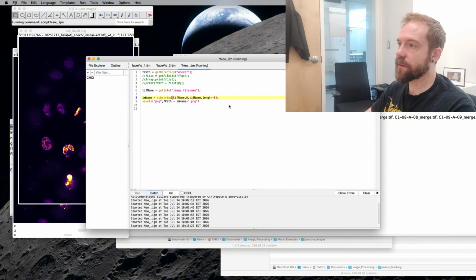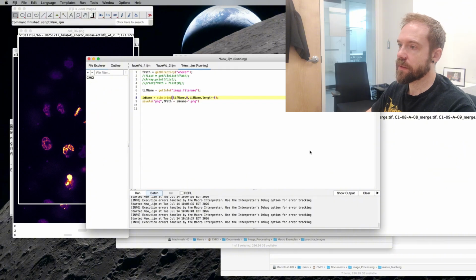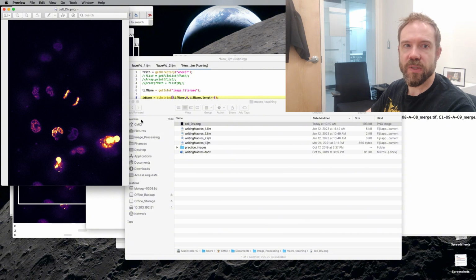So now I'll hit run. I'll save this in macro video recordings. I'll save in macro teaching. And if I now go to the macro teaching folder that I have, celldiv.png has appeared. Same as it was before.